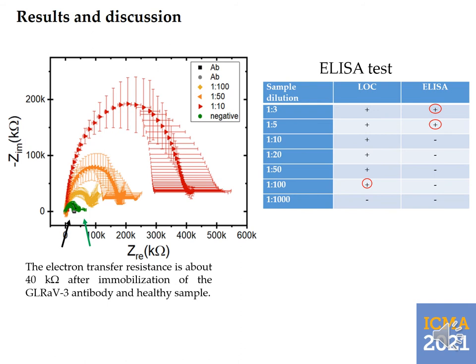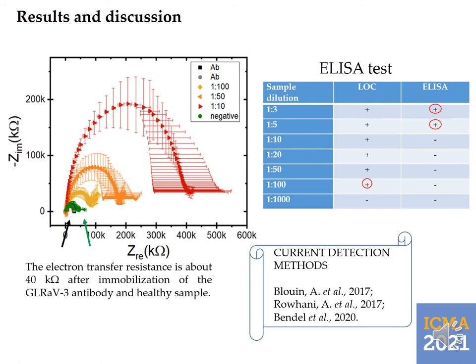Although serological techniques are commonly used for the detection of the virus, with a certain number of companies providing high-quality ELISA tests, molecular methods are also used, providing high sensitivity. New detection methods, such as the use of hyperspectral imaging, are now emerging as a promising tool for disease diagnosis. Among them, electrochemical impedance spectroscopy is used for the first time for the detection of this pathogen, revealing its potential in terms of portability and ease of use.